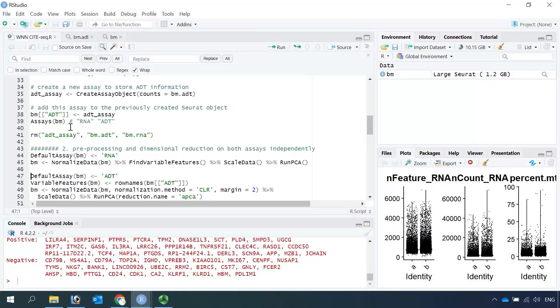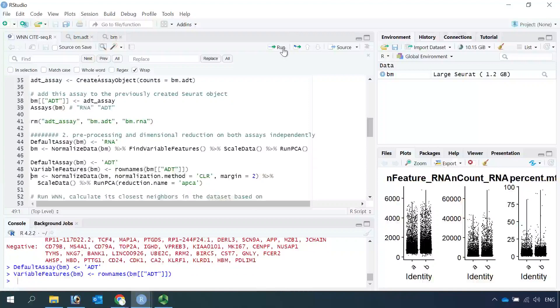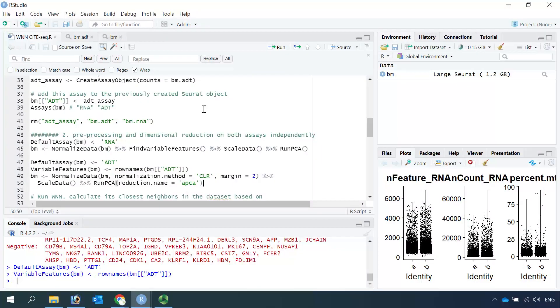Next we change the default assay to ADT and set the variable features as the row names, because the row names contain the 25 antibodies. Now we perform data normalization, scale the data, and run PCA. We set the reduction name for the ADT assay as APCA.